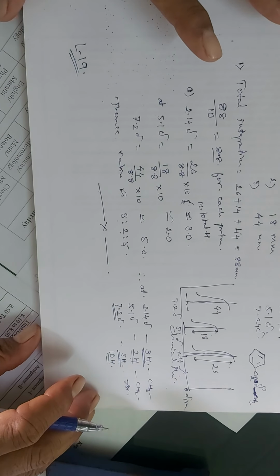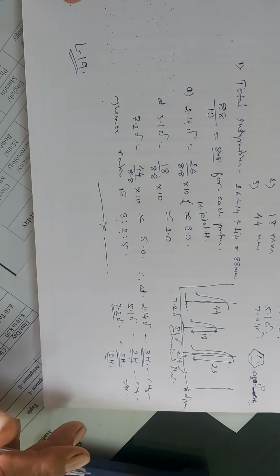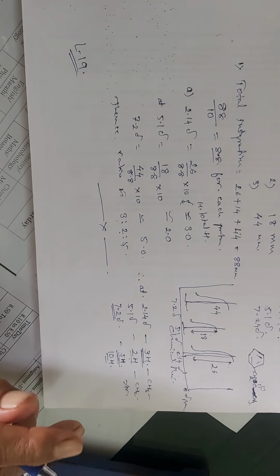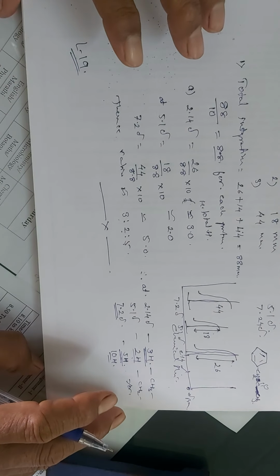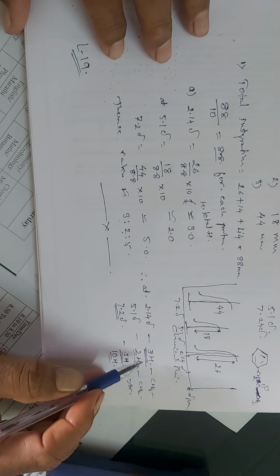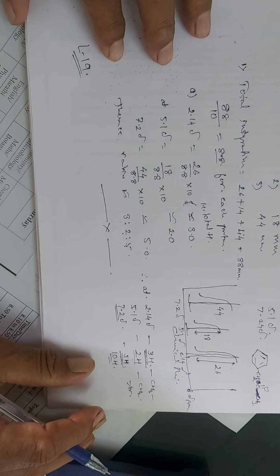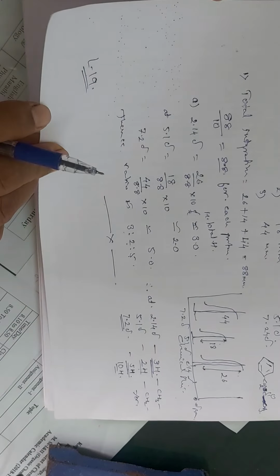So, we were discussing the area under the peak or the peak ratio, and then we have discussed this term, that is the integration and the integral value. And so, we are able to find out the integral value for each proton by using the integrations given in the NMR spectrum. But the number of sets of protons which we are getting here in the different molecules may vary, and so the number of protons obtained from the integration may be 1, 2, 3, 4.